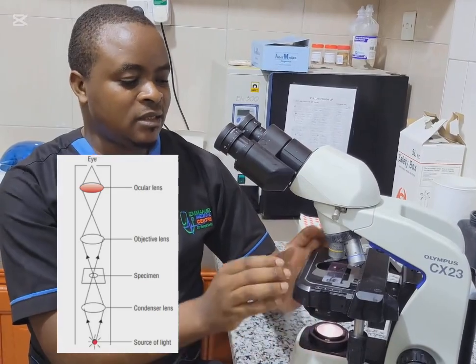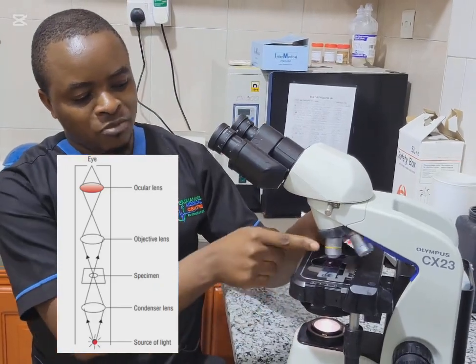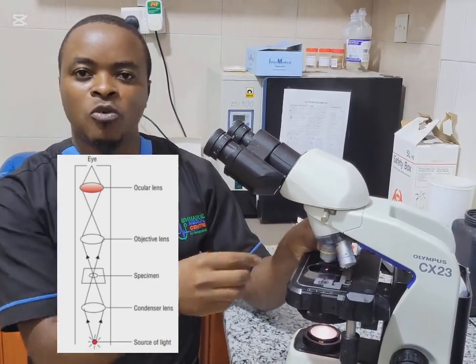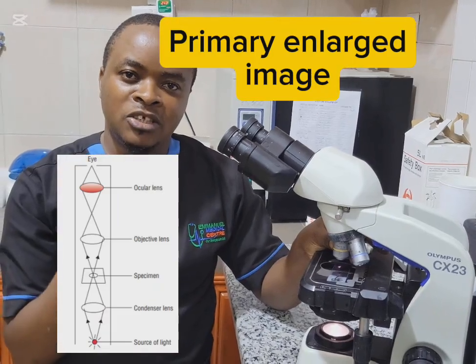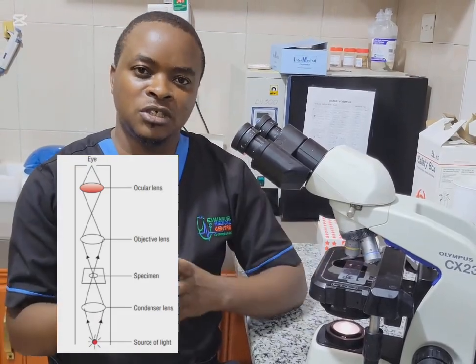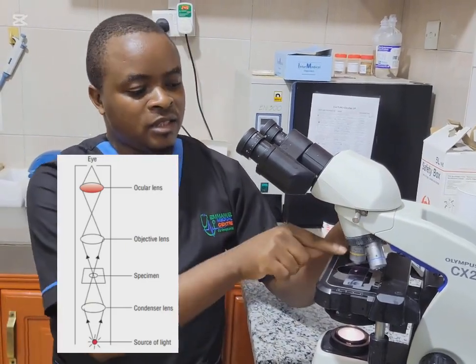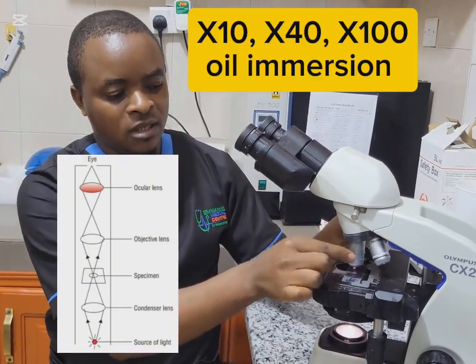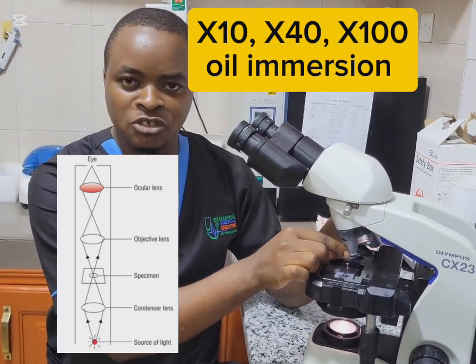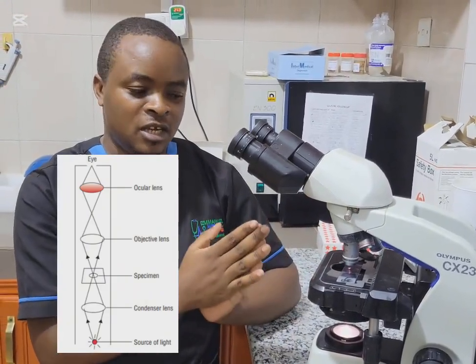Then when this light lands on the object on the stage, the light is going to be received by the objective lenses, and these lenses are going to form what we call primary enlarged image. So they form the primary image which is enlarged, depending on the objective lens, either times 10 or times 40 or times 100 oil immersion. And the role of oil immersion is to reduce the bending of light, what we call refractive index.